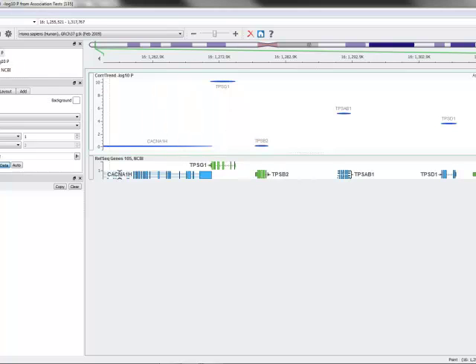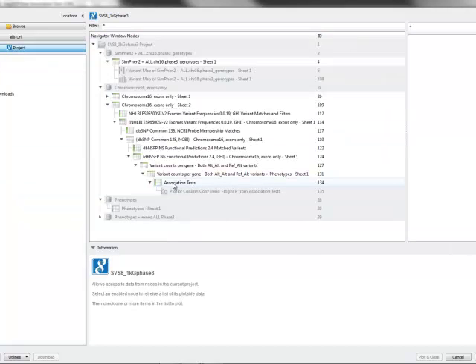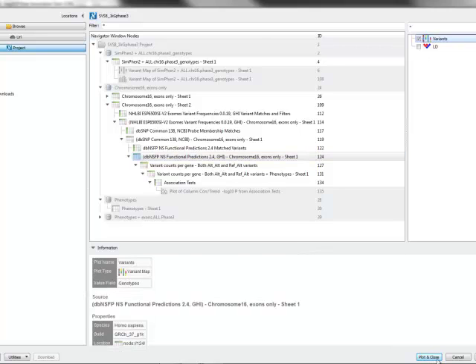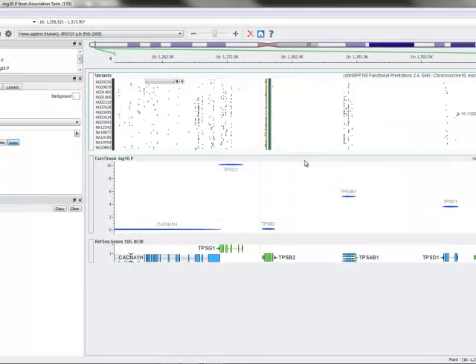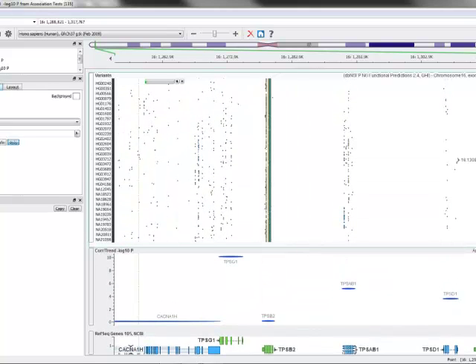And beyond that, I can add to the visualization the exact data used in the analysis. So we have this final list of filtered variants that came through our filtering process. I can create a variant map from that. Then we can sort based on the case control status.